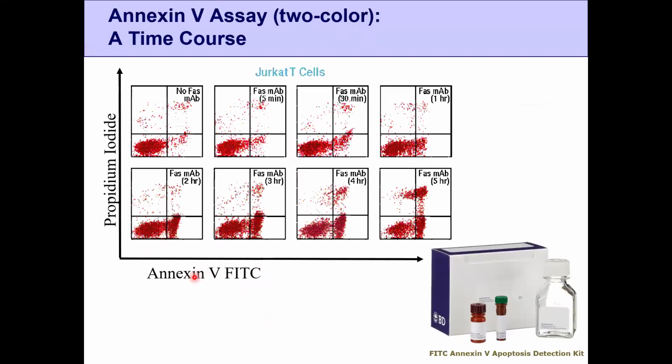Same goes for your PI and Annexin staining. They have shown what is happening over time. This is 0 hour and this is 5 hour. These are your live cells going toward apoptosis. These in between are your apoptotic cells, almost dead, more toward the dead side, and those tagged with PI are the dead cells. So after 5 hours, this much of the cells are dead.